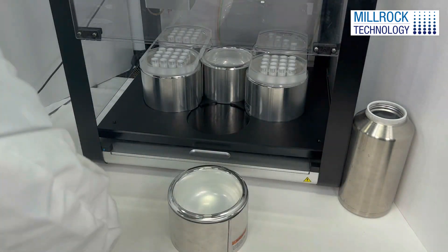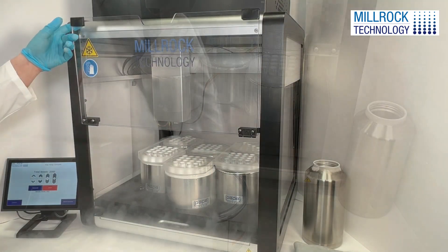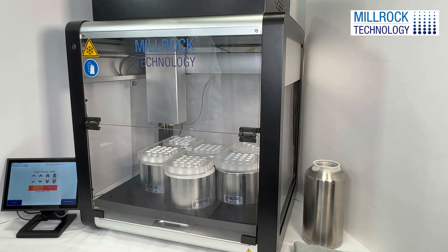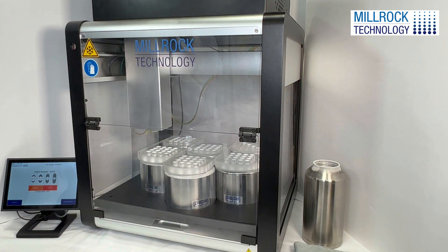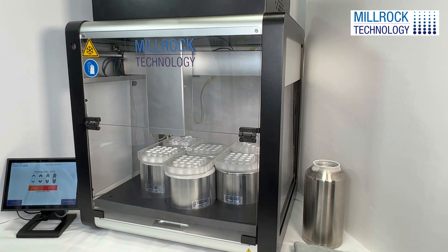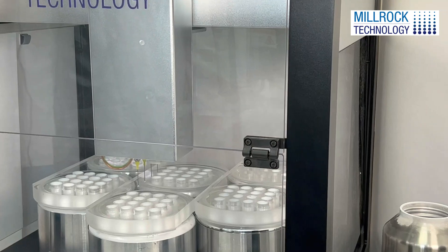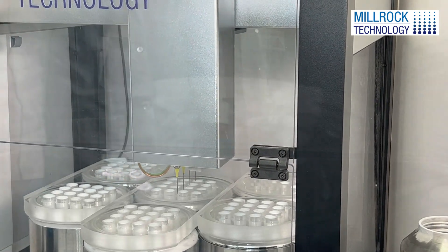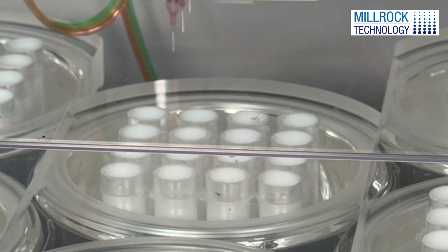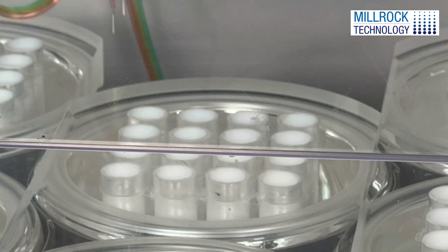The Bead Lab automated micro-dispensing system is used to create the beads. Lyo beads are spheres of customizable lyophilized material that contain a specific volume of active ingredients, typically in the 5 microliter to 20 microliter range. Lyo beads are created through instant freezing of the liquid formulation in liquid nitrogen and then freeze drying.